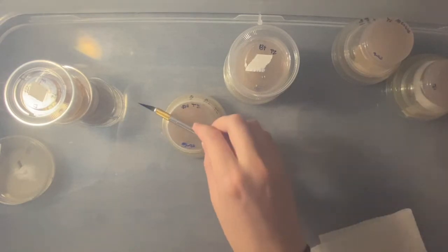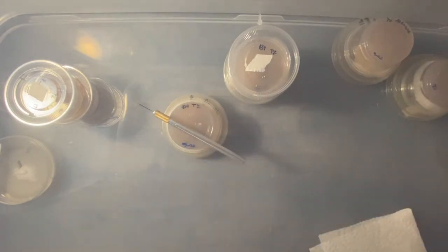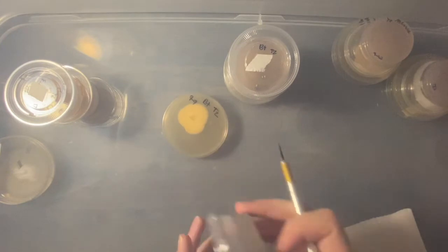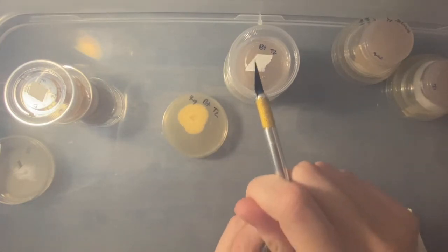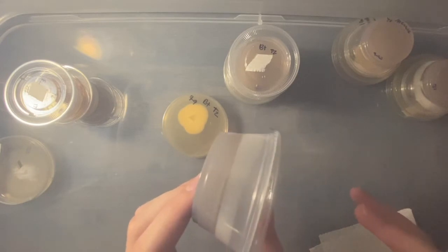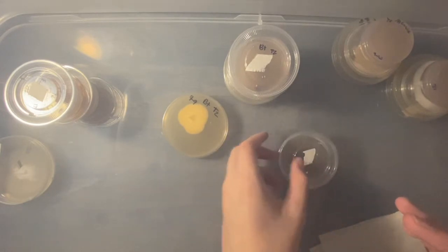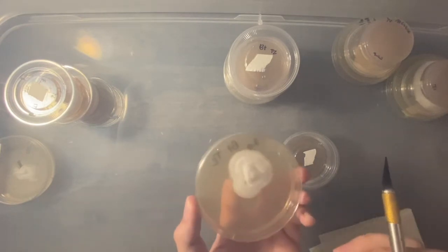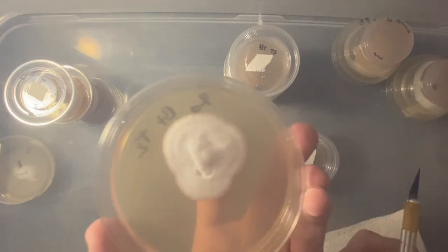So I'm gonna sanitize my hands again. Sorry, not sterilize. I'm gonna crack this lid. Alright, this is a really thick plate. I don't know why I poured it so thick, but that could have easily gotten me 2 plates. Alright, this is beautiful, beautiful growth.